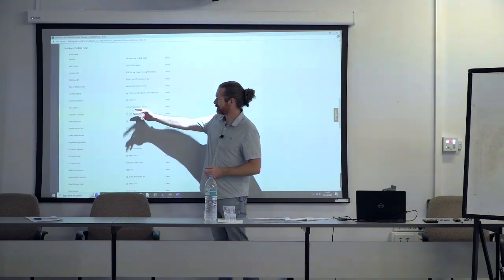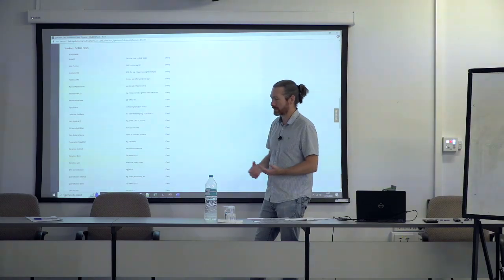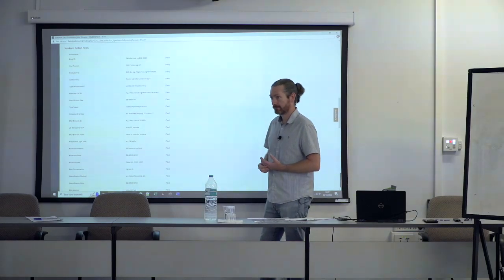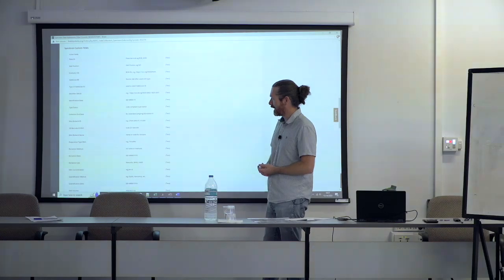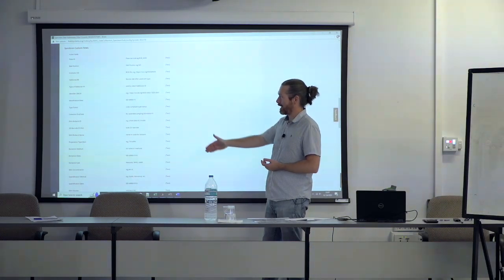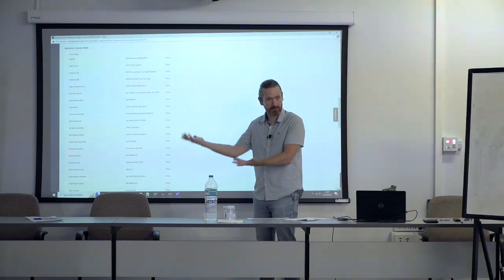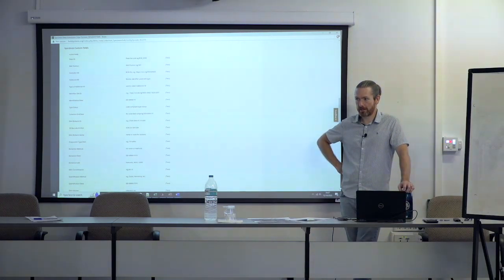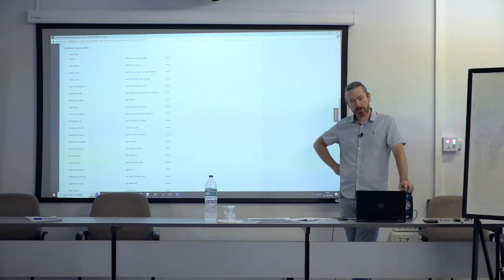Like type status, which is oddly not included in the standard BOLD fields, but I guess people weren't really sequencing types. Yeah, date of identification. Yeah, because taxonomy is obviously fluid, changes over time. Those things, yeah. They're custom for now, but as BOLD improves, we will see how many of these actually make sense that everyone should have them, you know, as an option at least. So we should make sure that it's a 4-digit date. Yeah. And of course, it would be more sensible to use the ISO standard date.